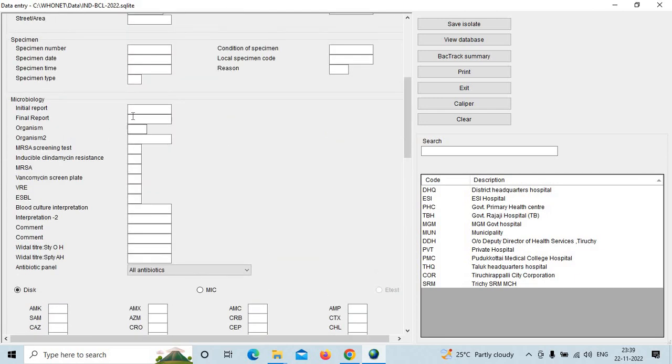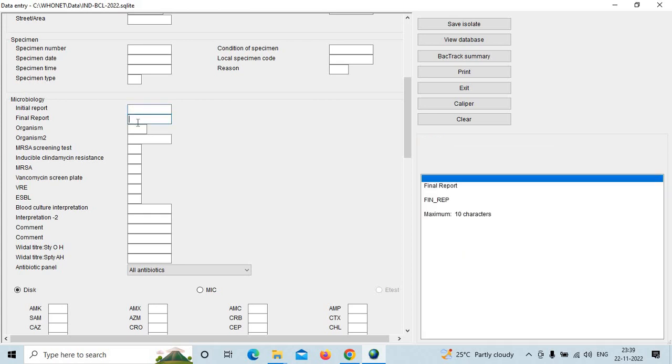We are just one step away where we need to configure all these data fields, and the configuration file is available in the code files.